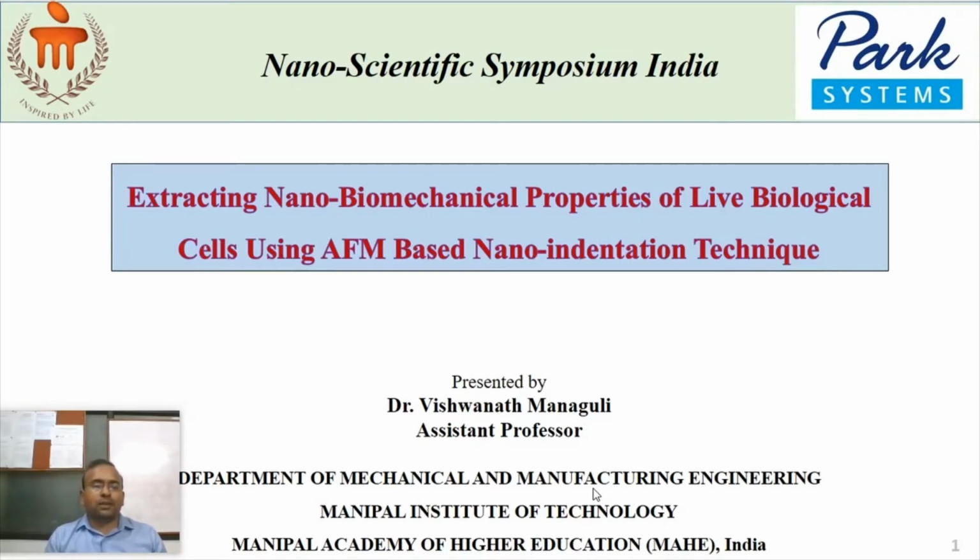Today I'm going to present my work related to extracting nanobiomechanical properties of live biological cells using AFM-based nanoindentation technique. This work is carried out in IIT Delhi.